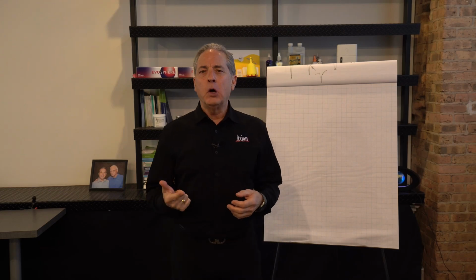So it's time to unveil more mysteries to you in the HPLC world. And today we're going to talk about some more specifics of your stationary phase, and that is things like the surface area and the carbon load. So if you've never heard those terms, this is a really important talk because this will give you some of the specifics, what makes one C18 column different than another.